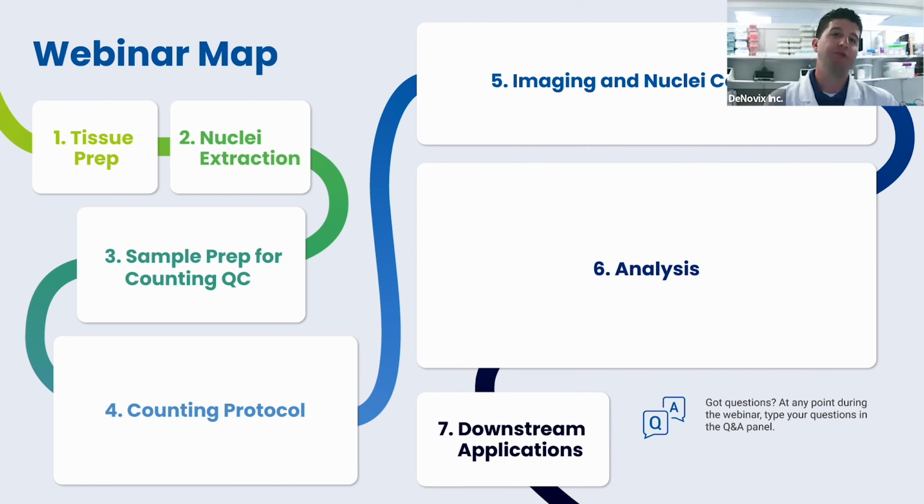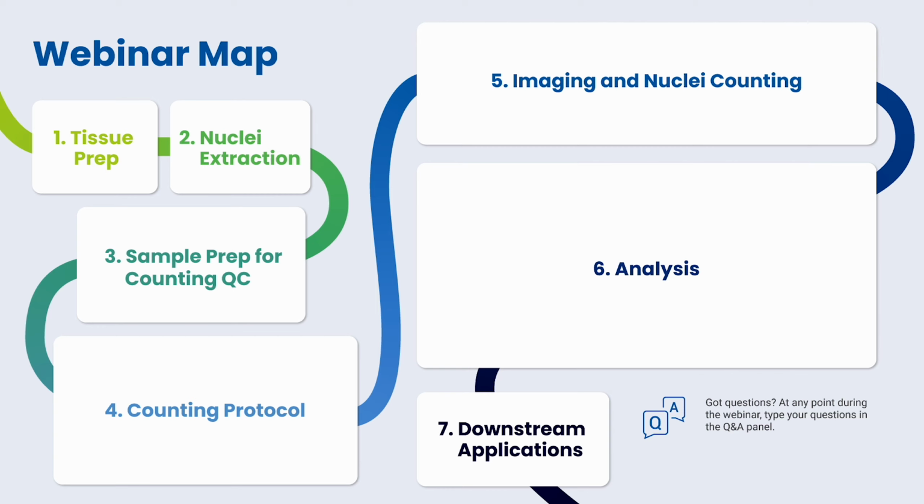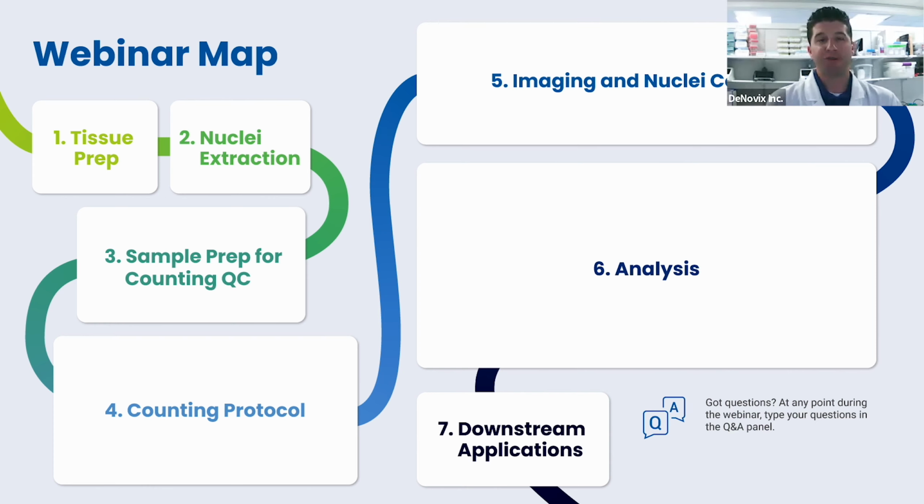After that, I will show you the counting protocol, so all the different settings that the CellDrop can use to best quantify the nuclei to your expectations. We'll talk a bit about imaging and nuclei counting and the different ways to do that and what the CellDrop can offer there. Then for the analysis portion, I will actually do the live demo.